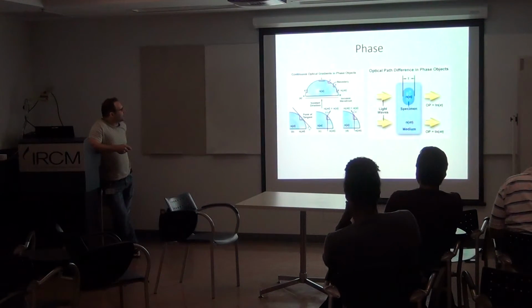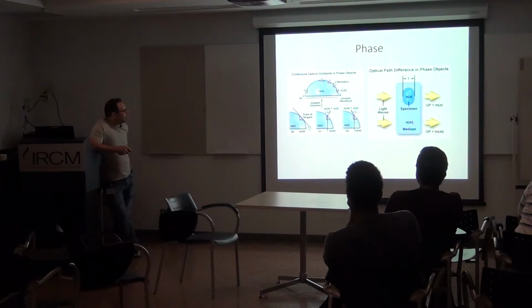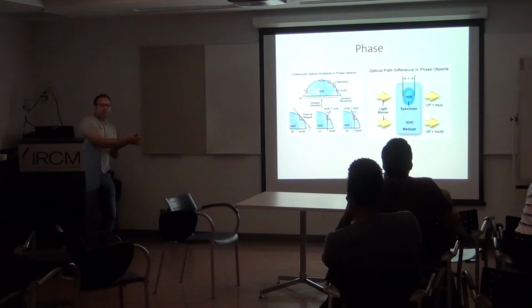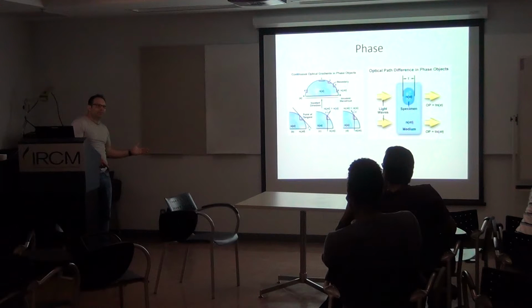Phase contrast. So everything that has a different refractive index. Light is not going to go at the same speed in a different refractive index.